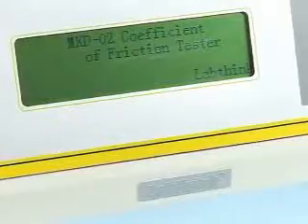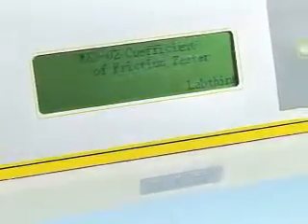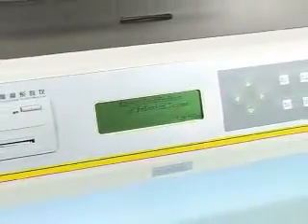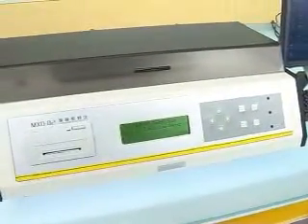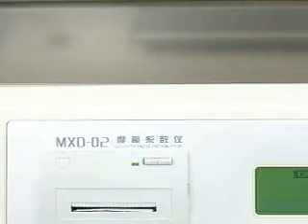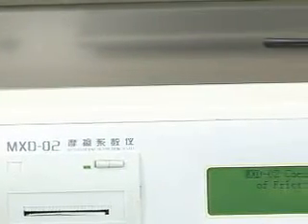MXD02 Coefficient of Friction Tester is applicable in static and kinetic coefficient of friction tests for plastic films, foils, paper and other materials. Users can control the quality-technical data by testing smoothness of the materials, such as the usual pack-fill property of packages, the speed of packing machines, and so on.